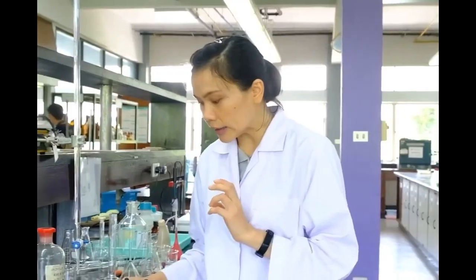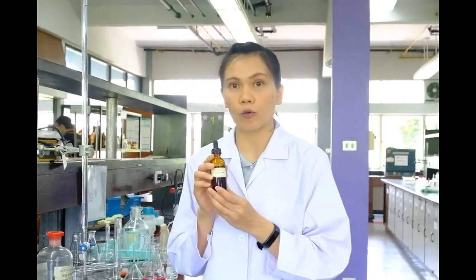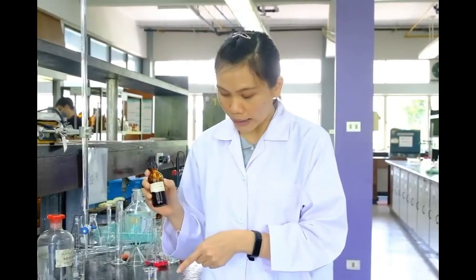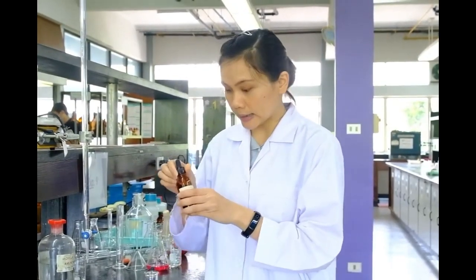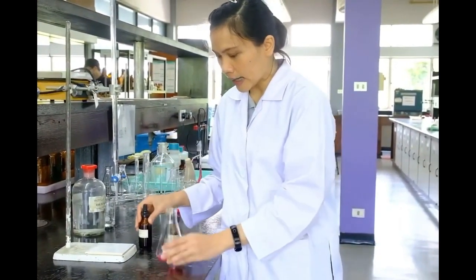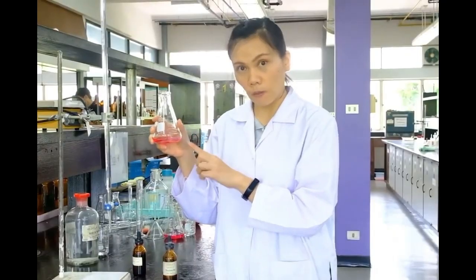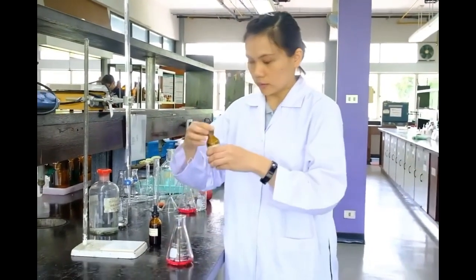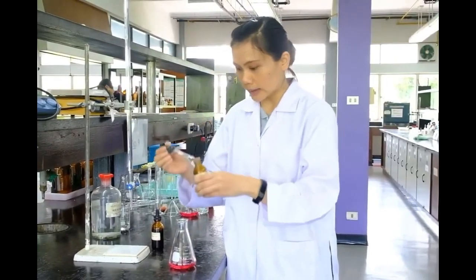So we need 2 indicators. The first indicator added is methyl red, which will first change color to orange because it initially turns red when added to maleic acid. Then, we titrate from red to orange. Once the orange color is achieved, the remaining second proton will change color in the phenolphthalein range.